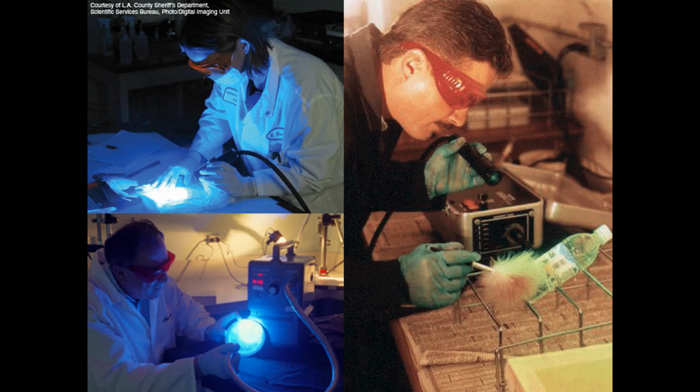So these are various alternate light source setups. This guy's using a green laser light. He's got the power supply here. It's got a long fiber optic cable and a shining laser light, and he's dusting for prints on this bottle. And notice he's wearing orange glasses. We'll show you what's going on there.